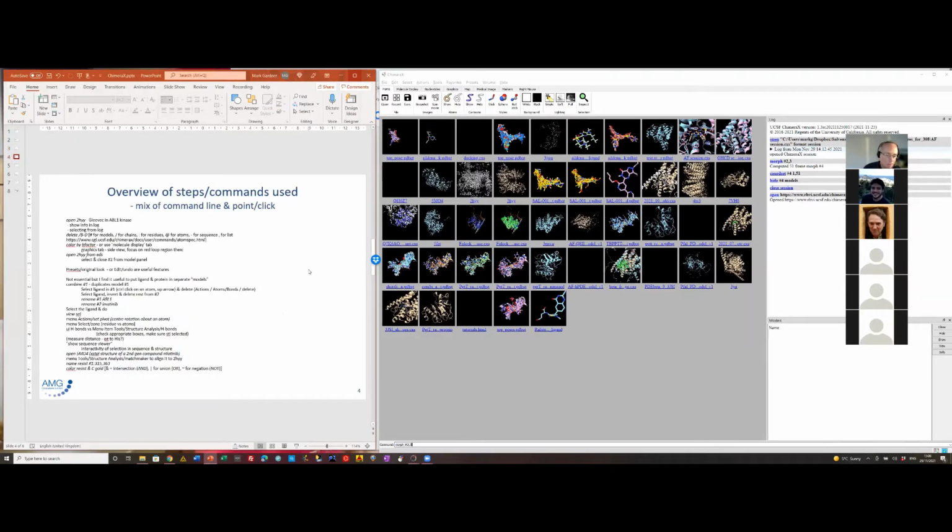I'm just going to go through some of the things about looking at a small molecule ligand protein complex that I find useful, and then we'll have a quick look at some AlphaFold things and some docking. So first of all, getting a PDB structure into ChimeraX. There's a range of things in the interface that are useful. The command line down the bottom here has probably a very small font. Apologies for that. That's why I've put some of the commands in the PowerPoint, which I'll also put a link to under the video and perhaps distribute to those of you on this call, if I can find you on our distribution list.